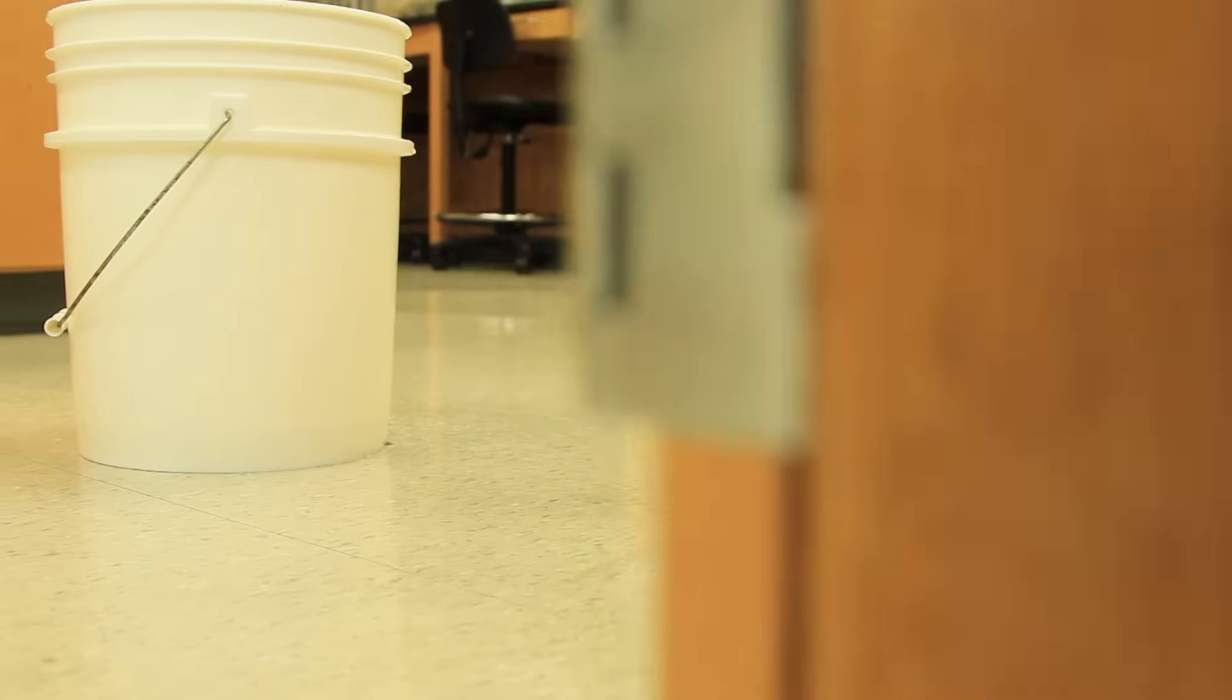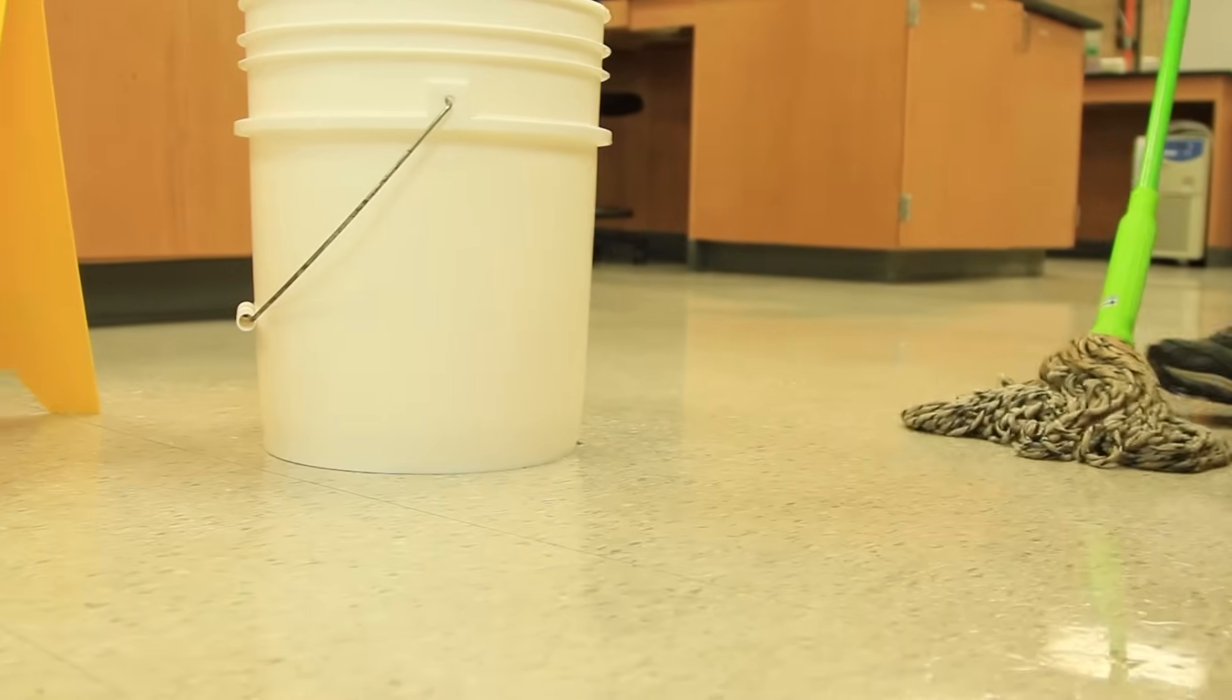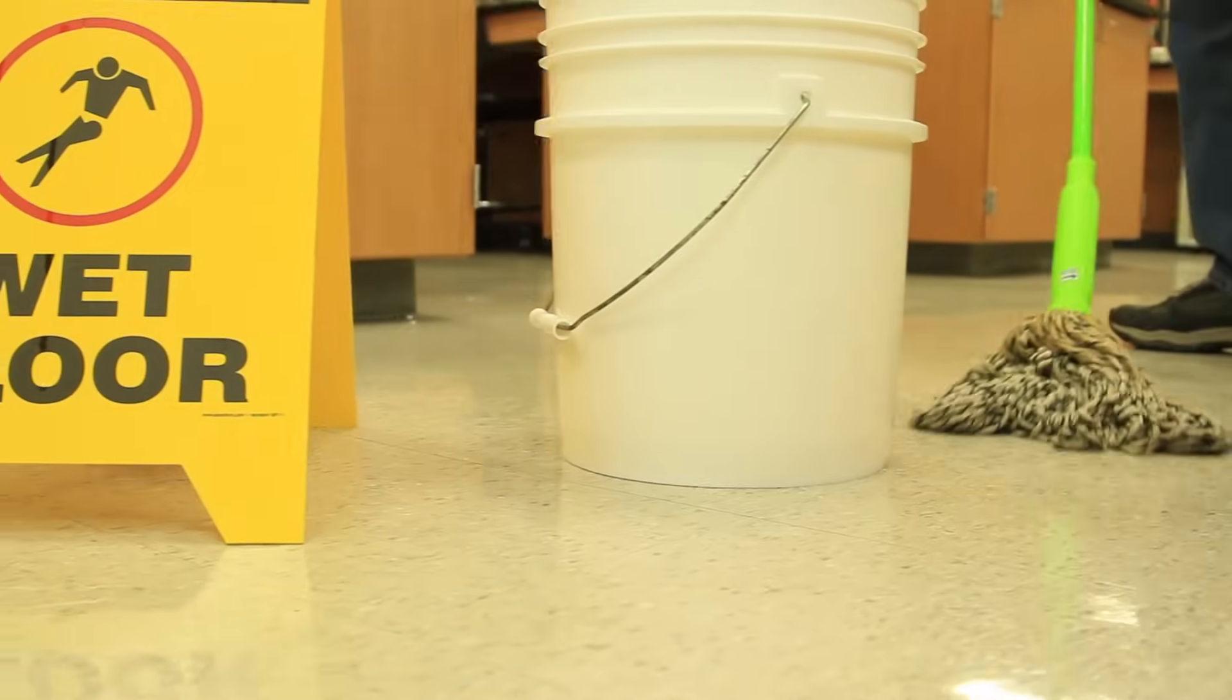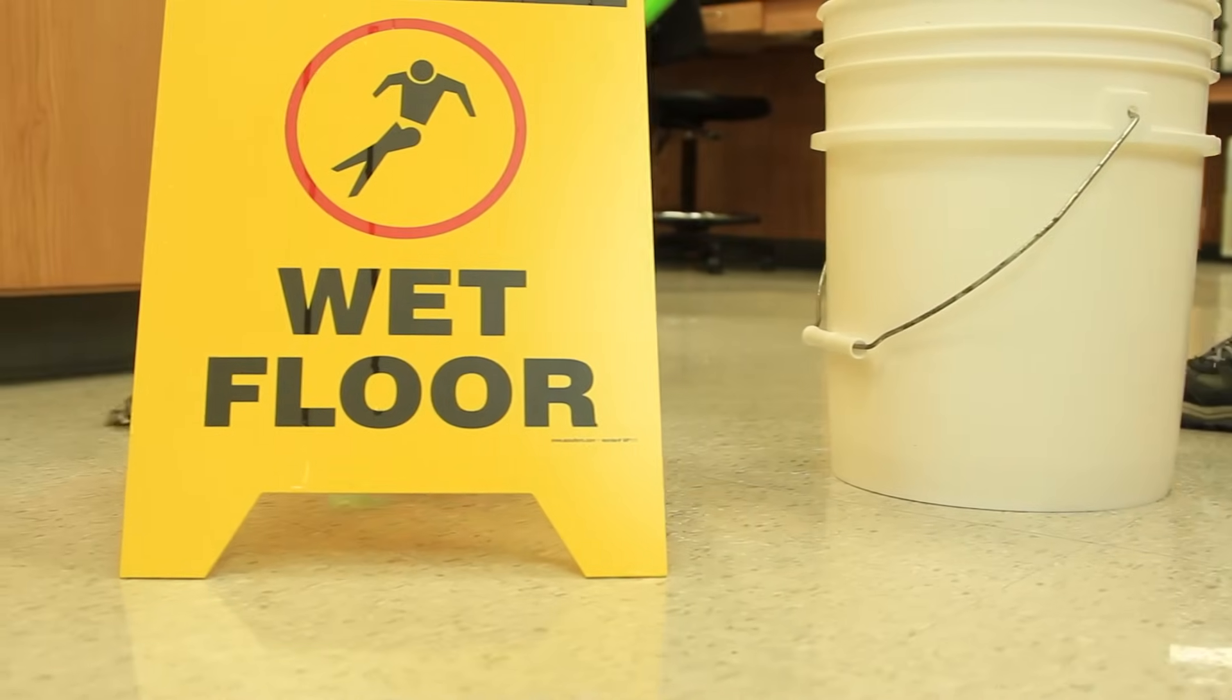If you do make a spill, check the safety data sheet for the appropriate response. For a routine spill, clean it immediately and place a wet floor sign.